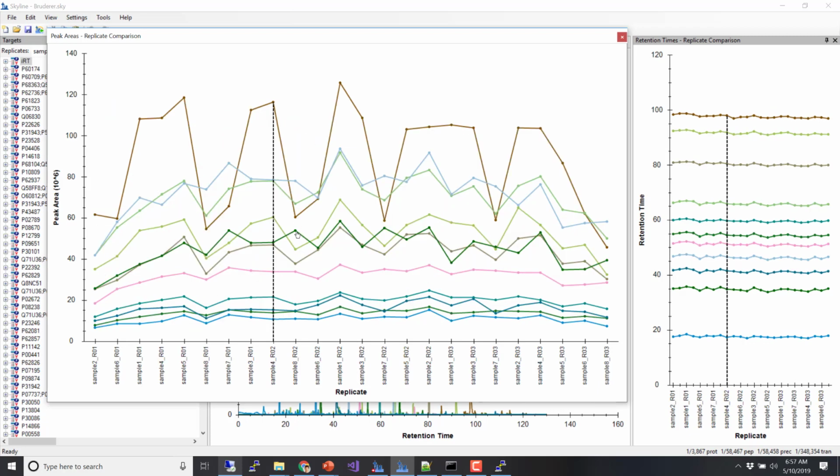So let's go back to acquired order. Here we're actually kind of happy with the acquired order, right? They're not going 1, 2, 3. This is replicate 1, and they've gone 2, 6, 1, 4, 5, 8, 7, and 3. That seems kind of randomized. And then even better, the next one is randomized in a new order, right?